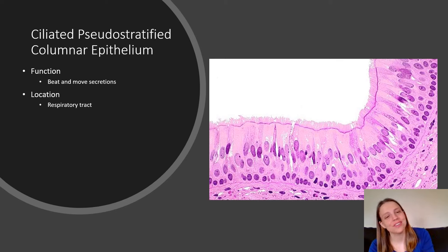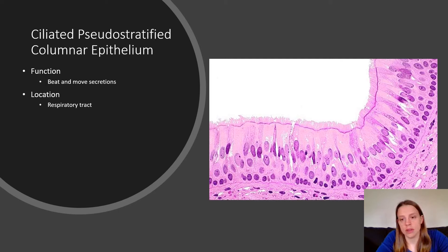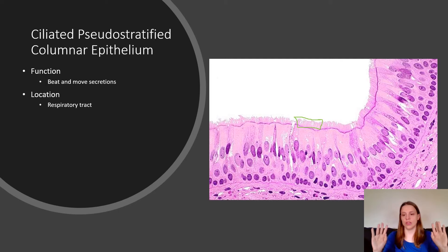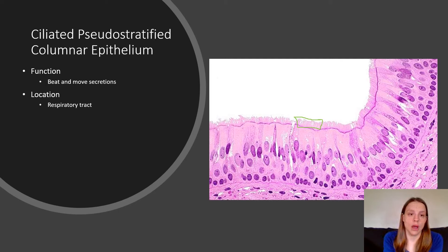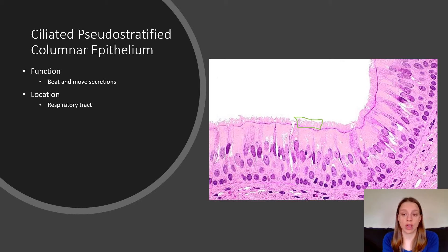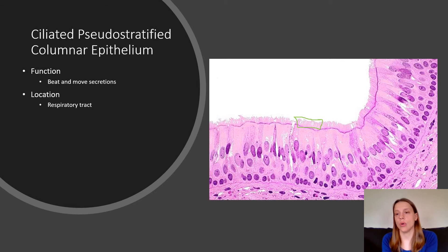Everyone loves this name: ciliated pseudostratified columnar epithelium. Ciliated refers to the little cilia on top — their job is to move in a wave and move things along. Pseudostratified: you know stratified means many layers, but the word pseudo means fake or false. So pseudostratified means it looks like there are many layers, but there's actually only one layer.